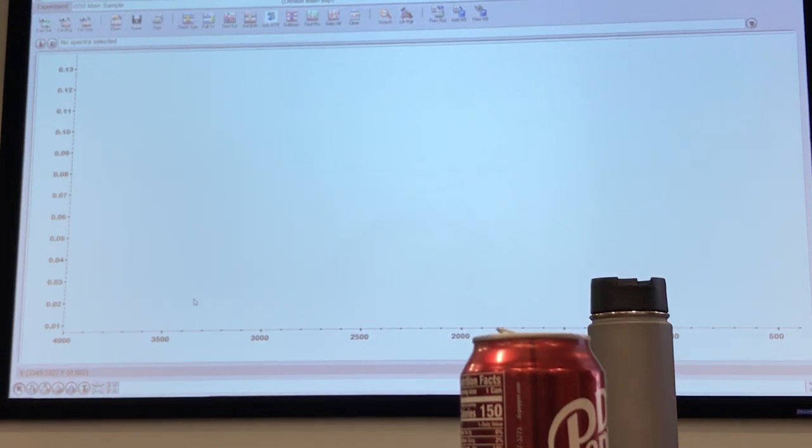But sometimes, in this case, when you looked at the spectrum, that one was an easier sample to do at that size, because you're looking for just two differentiations. One was polyethylene, and the other was just the tissue. So you had basically two regions to differentiate. But on a normal sample set, it can be way, way too much, and then there are always particle overlaps and other things. That's where the more challenging cases come in, like when particles overlap, or when there's too much in there, one underlying layer with particles sitting on top of particles. In spectroscopy, they call that matrix interactions. Your matrices are completely different between tissue and polymer, so something is going to pop up very differently from the other material.